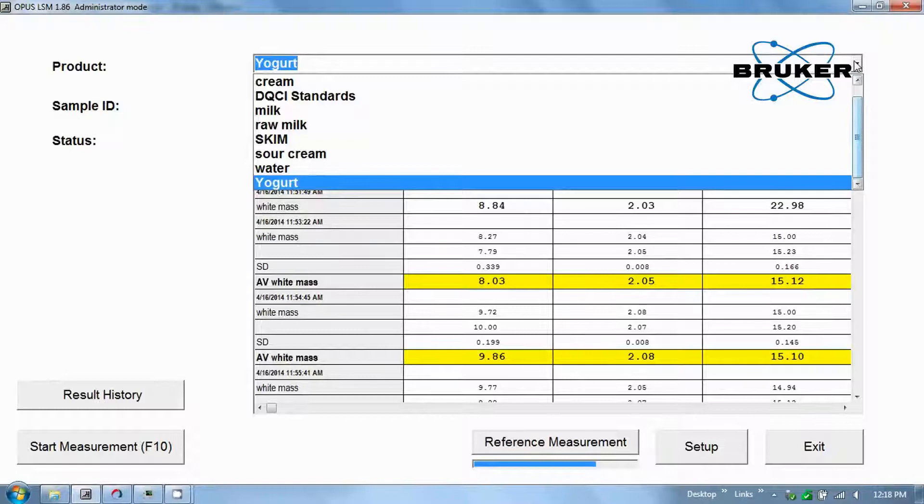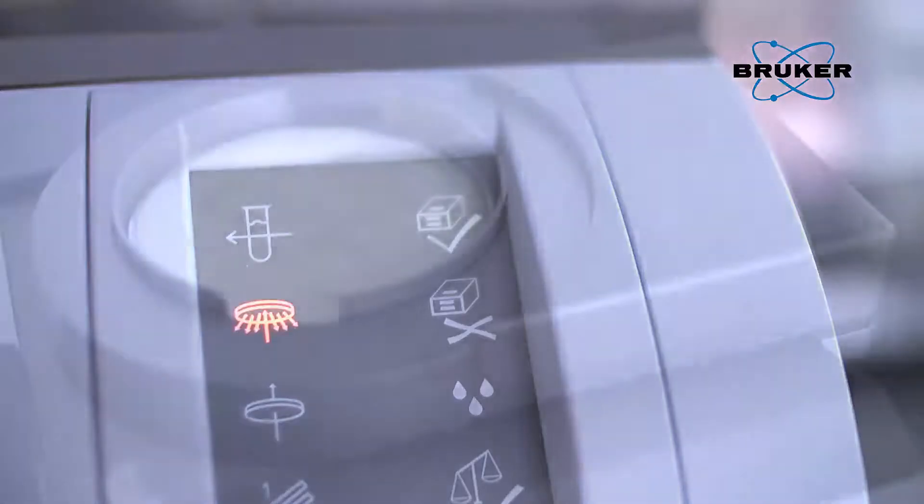Using the pull-down menu, yogurt is selected and the measurement can begin. While the measurement is running, you can place a fluid milk, whey, or cream sample.